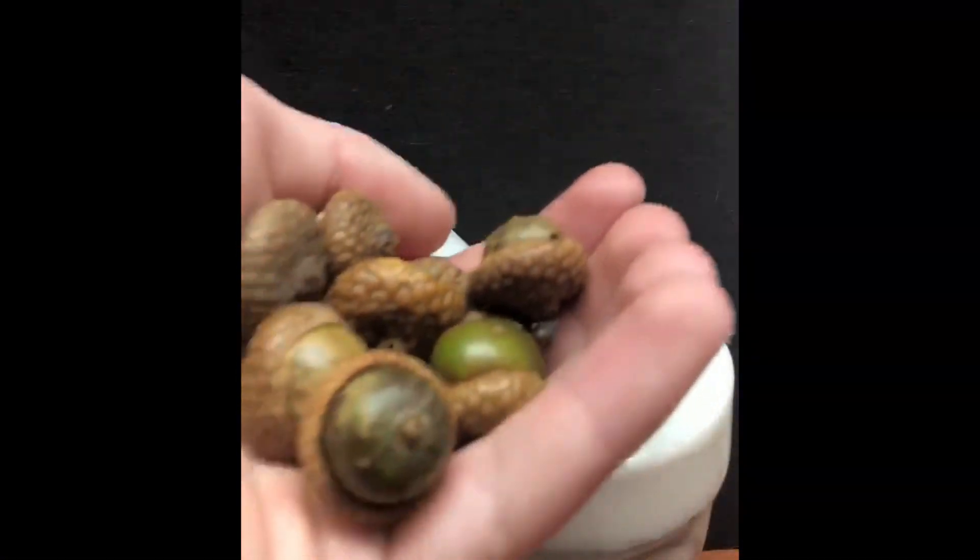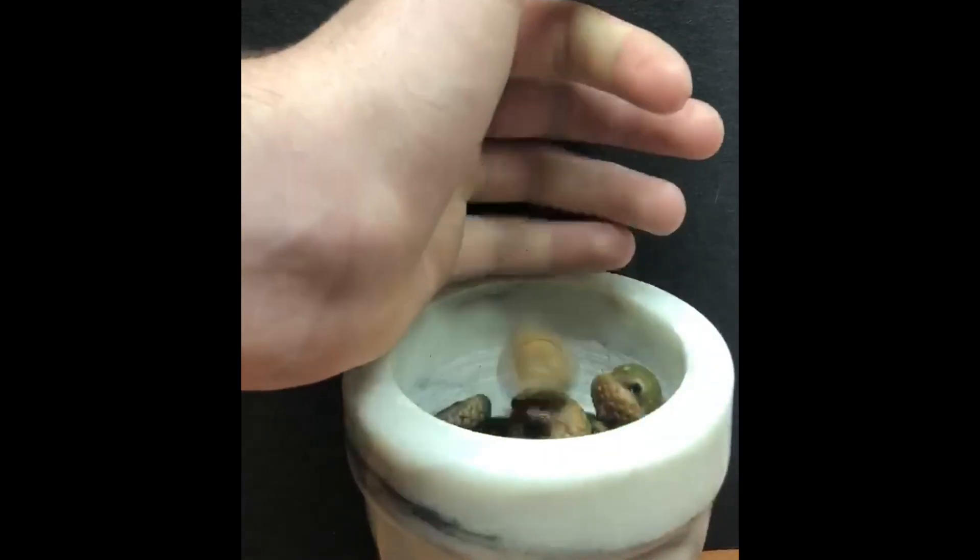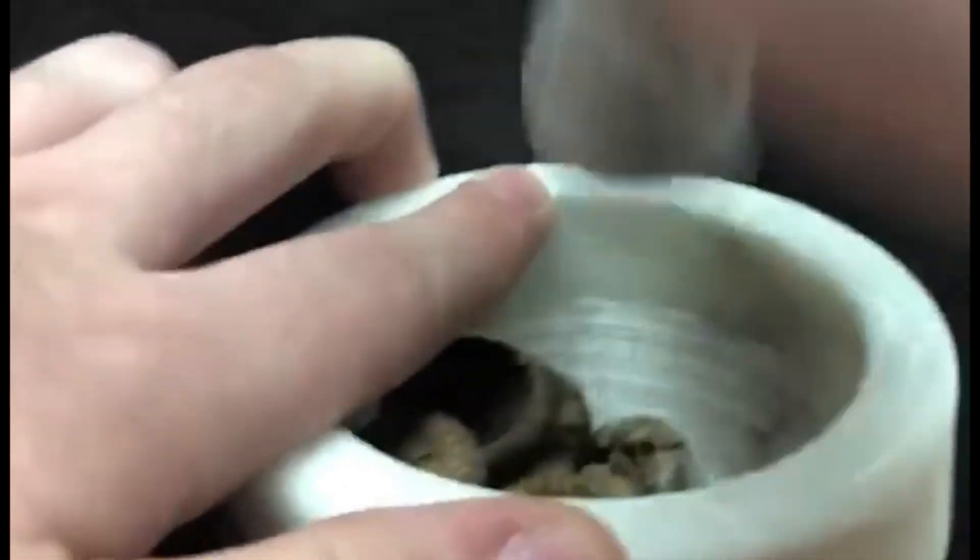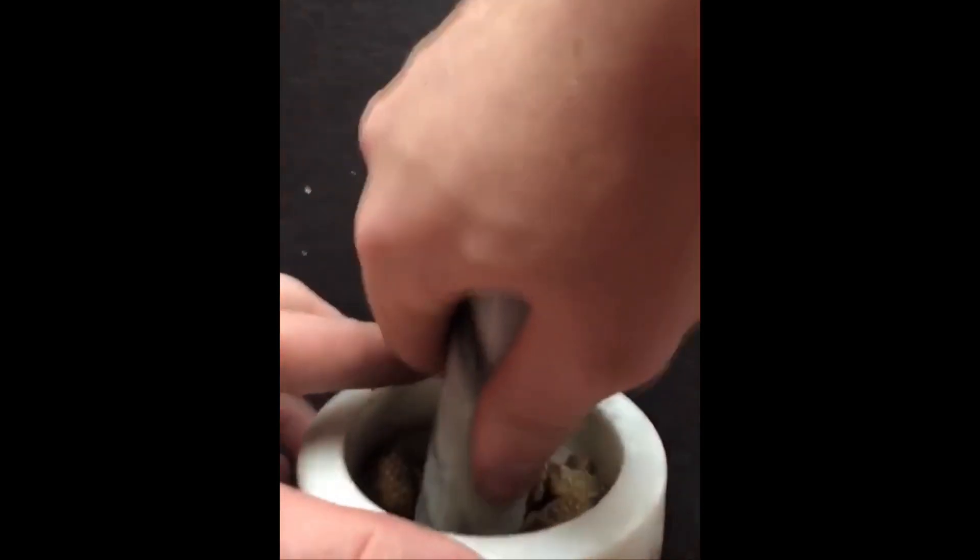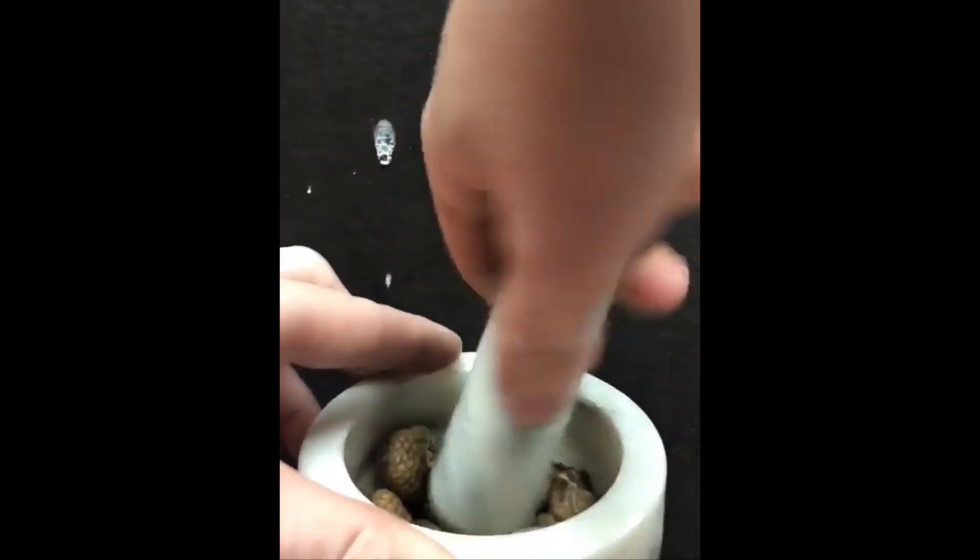Firstly, I will be grinding up acorns. Oak galls would work way better, but I'm geographically limited and they simply just don't exist where I live. But acorns contain a high level of tannins, so therefore they should work for the synthesis.